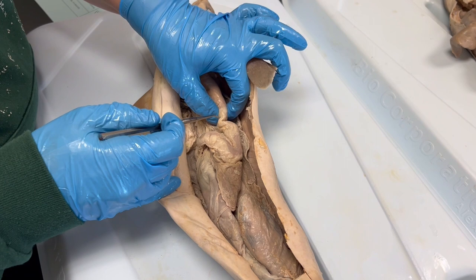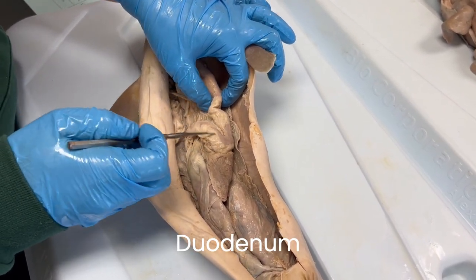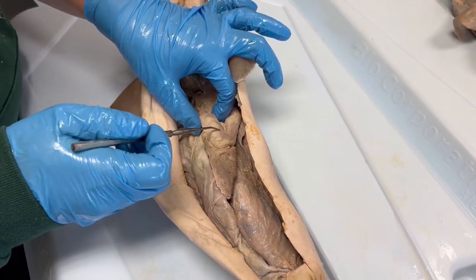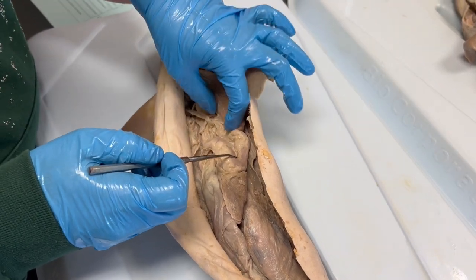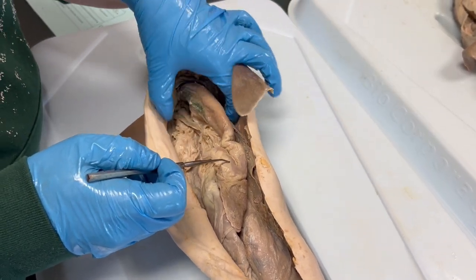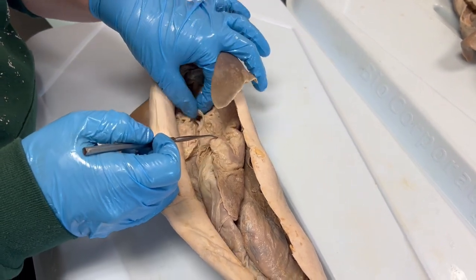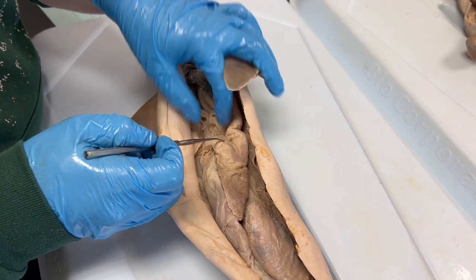Partially digested food will enter the duodenum, which is the first portion of the intestine of many vertebrate animals. The duodenum is going to receive a lot of digestive enzymes from other various parts of the digestive system. Both the pancreas and liver produce components necessary for the chemical digestion of food, and those components are added to the food in the duodenum.